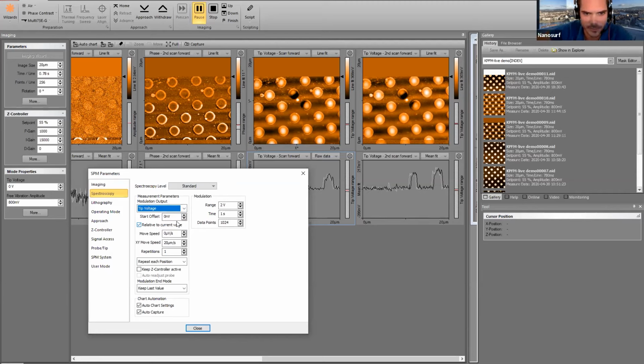The next is, is there a BNC port or some other port on the instrument where one can take the raw data from either lock-in and watch it on a separate laboratory oscilloscope? Yes. So we have here a signal access module that is connected to the controller, and there you have also monitor exits that give out the signal, so you can select different signals to put out to an external source.